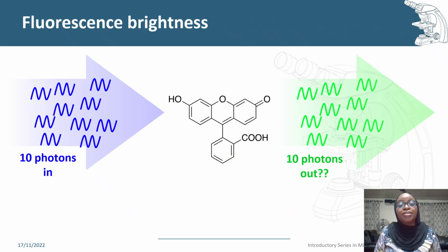The next set of slides will give more insight into this process. If you look at these slides, if 10 photons are used to excite fluorescence, will 10 photons be emitted at the end of the day? Will 10 photons come out?